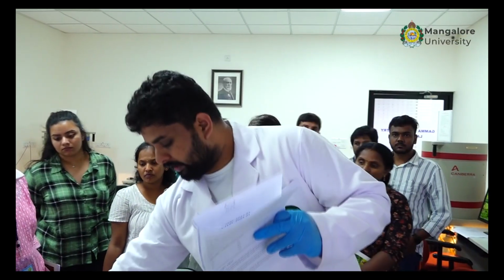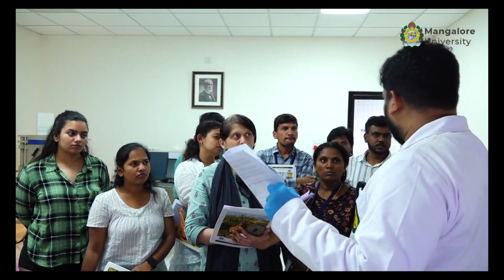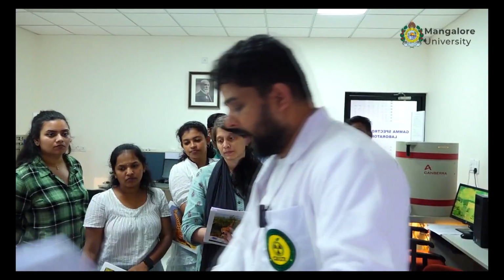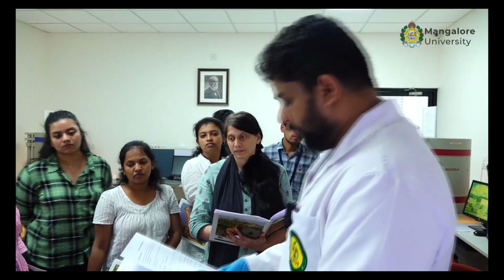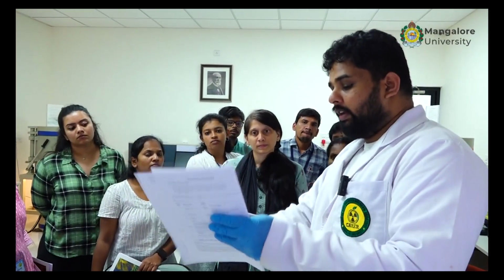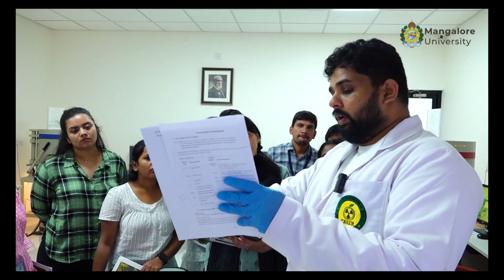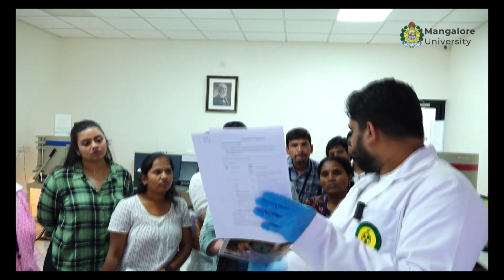Sample 7 is QC for strontium-90, that we cannot do by gamma spectrometry, we have to go to beta spectrum, so we will avoid it. And sample 8 is a blank. However, that's already explained to you. So the sample 1 and 2, they will give sample preparation, how they have done it. And you can see the radionuclide content in water too. Americium, barium, cobalt, cesium, tritium and strontium.